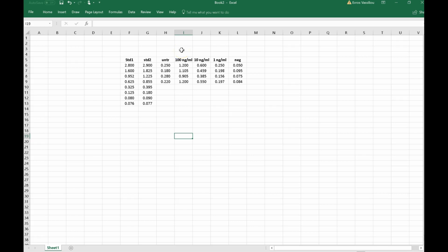When doing data analysis for an ELISA, after you complete your ELISA, you're going to get a bunch of numbers from your 96-well spectrophotometer. Those numbers are simply the amount of color in each well. The 96-well spectrophotometer we have, and typically any 96-well spectrophotometer, would give you optical densities. That's a fancy way of saying how much color they have. It would give it to you to 3 decimal places.